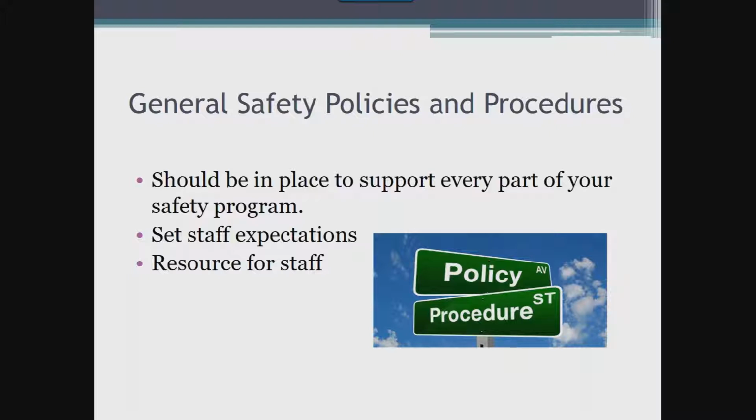Either way, not only is it important to have a chemical hygiene plan, which is either one or many documents, it is also important to have safety policies that cover general safety issues that may not necessarily relate to the chemical hygiene plan directly, but are necessary so that staff have a resource for all safety-related items that may impact them in their role in the laboratory. Staff should be expected to read and understand and have the ability to refer to policies and procedures for all safety topics, a few of which we will discuss later in this presentation.